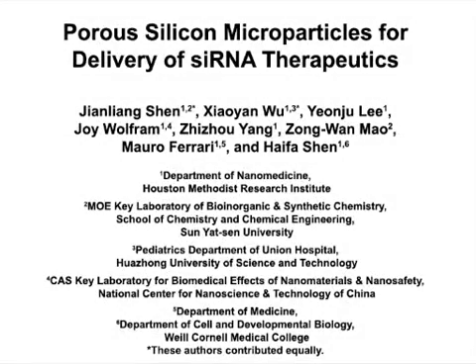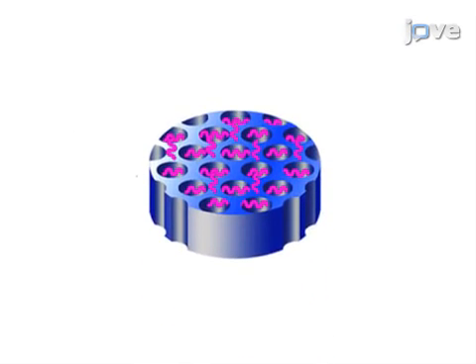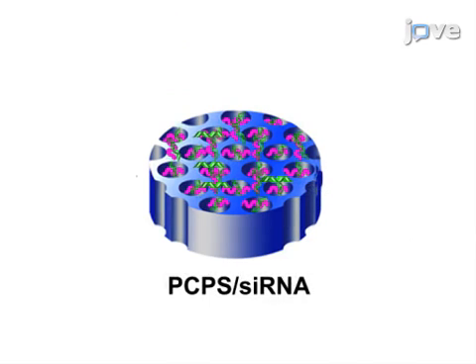The overall goal of the following experiment is to assemble and characterize a small interfering RNA, or siRNA, delivery system. This is achieved by grafting porous silicon microparticles with polyethylenimine and arginine to create a platform with a cationic charge. As a second step, siRNA molecules are mixed with the microparticles, which results in siRNA binding.